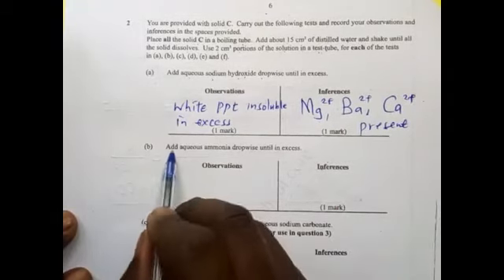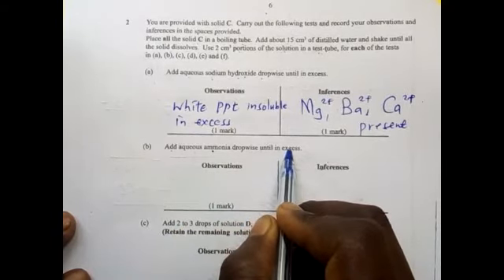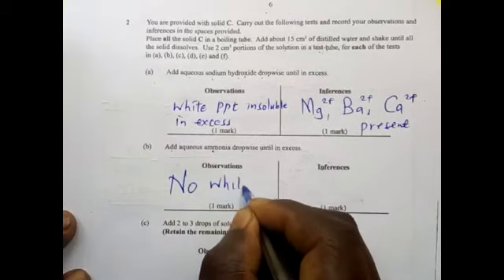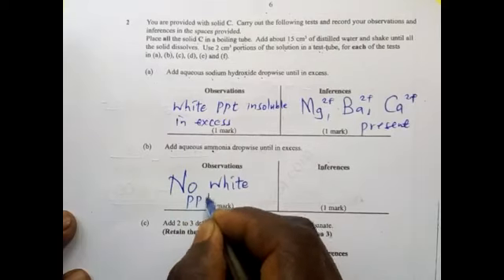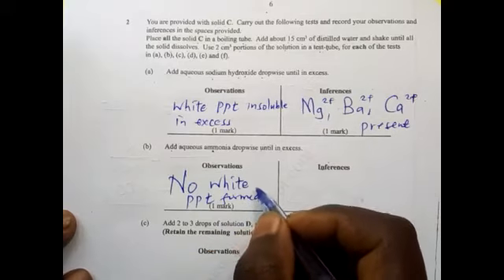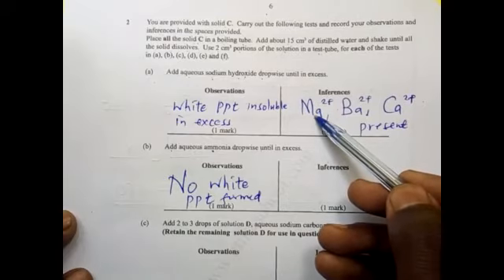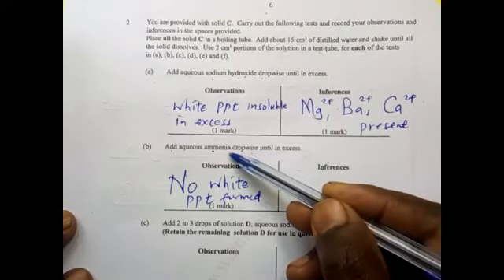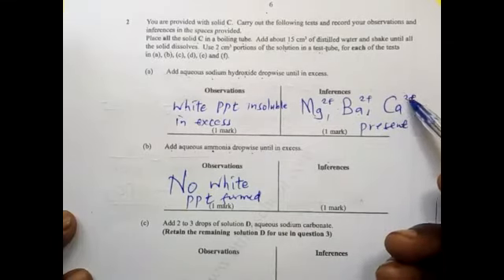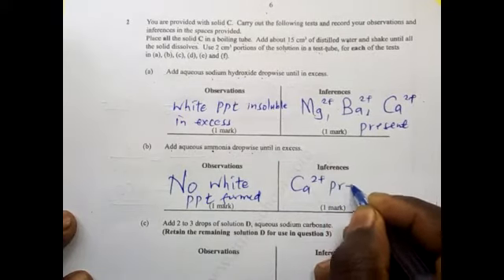Next, add aqueous ammonia dropwise until in excess. This time round there is no white PPT formed. If there is no white PPT formed and we suspect that these ones were present, this one forms a white precipitate with ammonia, but calcium ions does not. Therefore, it means that calcium 2 positive is present.